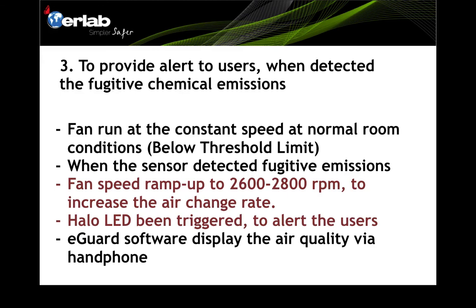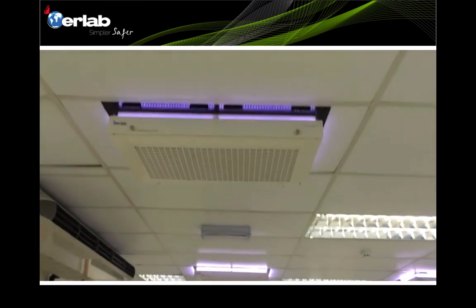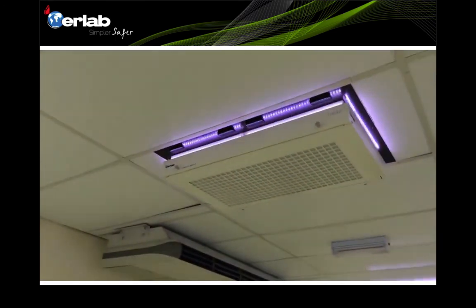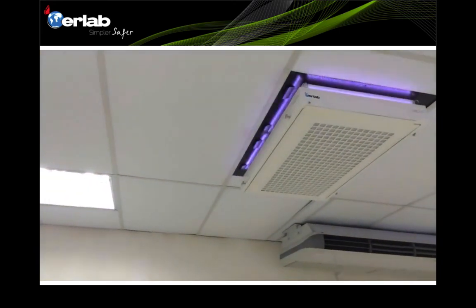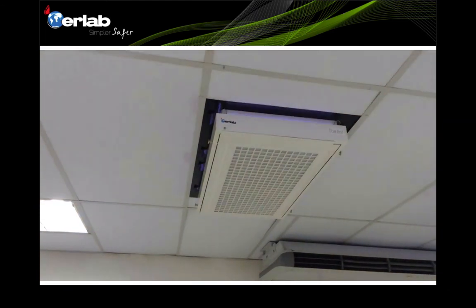Once emissions are detected, the Harlow LED is triggered and starts to blink, alerting the user that fugitive emissions are present in the room. The software displays air quality data via smartphone or laptop. As shown in the video, when the Harlow LED detects fugitive emissions exceeding the threshold, it starts to blink, and you can hear the fan noise increase as it ramps up to a higher speed.